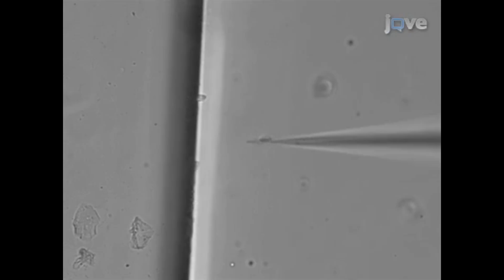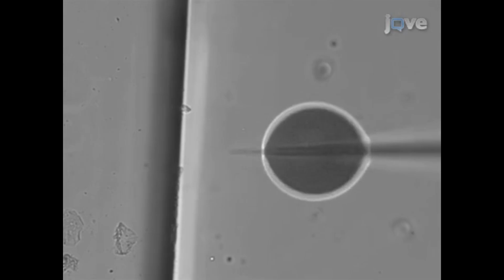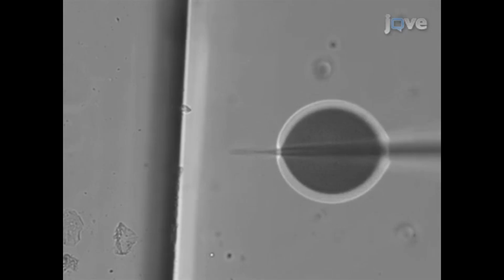When the needle gets clogged, move the needle to the broken piece of glass. With the glass and needle in the same focal plane, gently ram the needle into the glass. Test that the needle is unclogged by pushing the injection button and seeing if any fluid exits the tip of the needle.